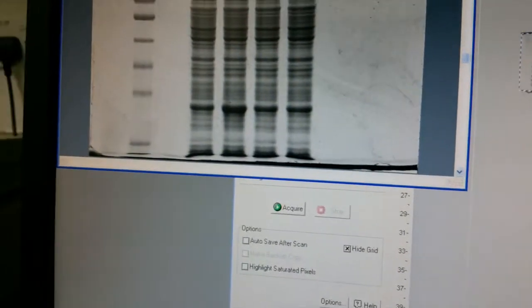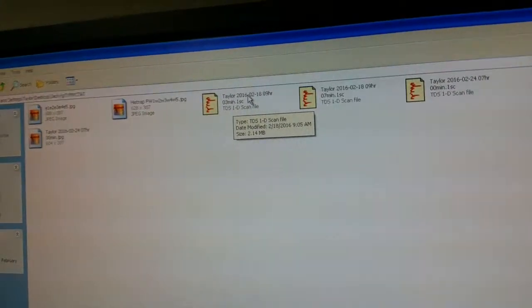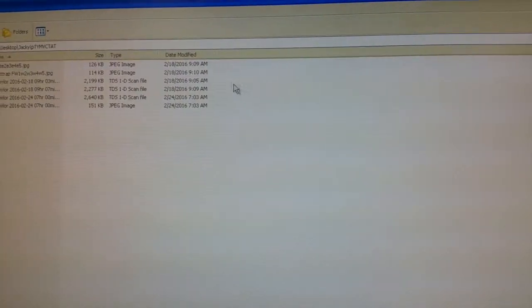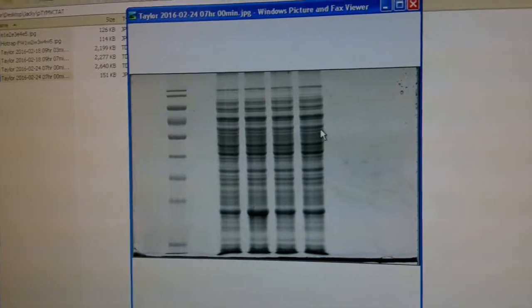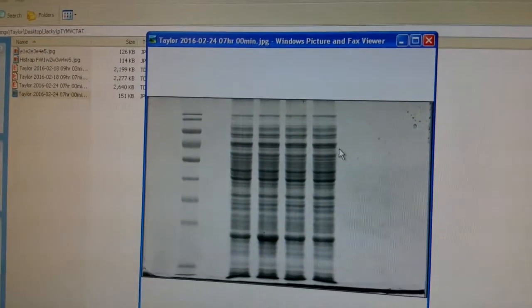Navigate to your folder to find the file. It takes a moment to find the latest one — but there it is, you have it.